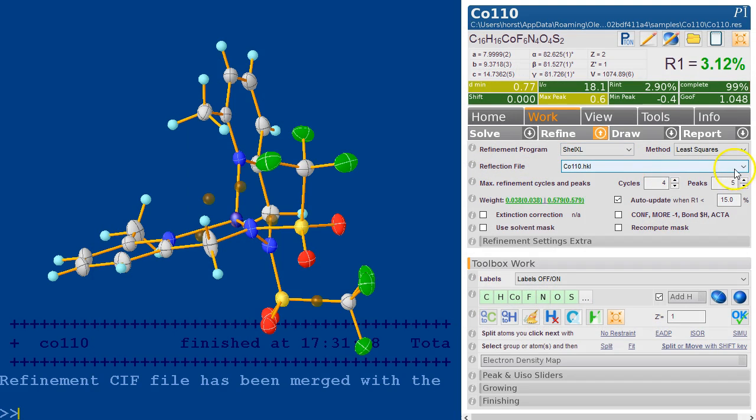This means you could have a number of different hkl files against which you refine. It doesn't matter what it's called. It will copy it into that temporary folder and it will then manage everything by itself.